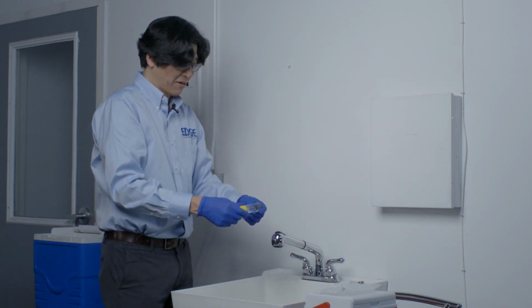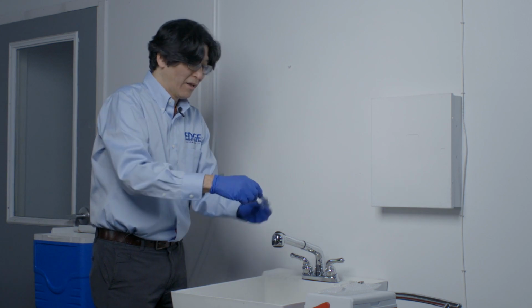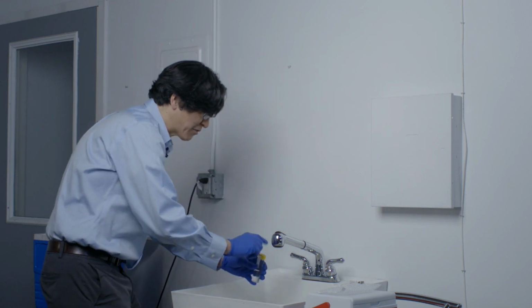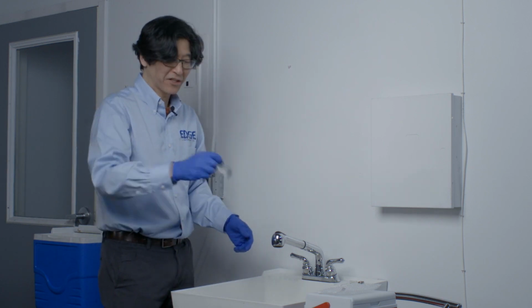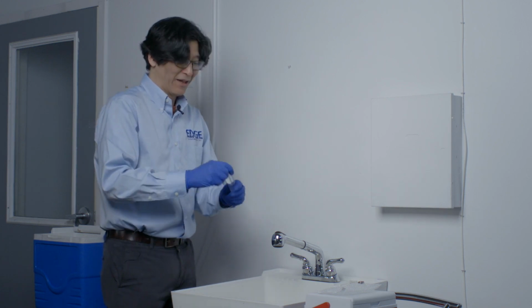And then we're going to just take a look at our sample. We're going to tip it upside down, take a look at it. We don't want to have any bubbles in here. So if we see a big bubble in here, I would just come back here, turn on the faucet to a slight drip, and fill it back up and recap it. So right now, this is a good looking sample, so what we do is we just agitate it. This gets the acid and the ascorbic acid all mixed up, and there we have it.